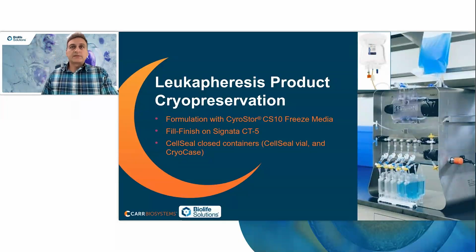For example, for cell expansion, we use the GREX platform. For cell selection, we use the Miltenyi platform. For cell expansion media, we used ex vivo plus ICSR. And for cytokines, we used those from Akron. So combining all of these together with our tools, we try to simulate this end-to-end process and understand the difference that it makes if you start the process off of a fresh Leukopak or a fresh apheresis product versus a frozen apheresis product.